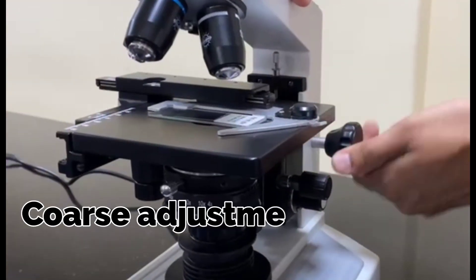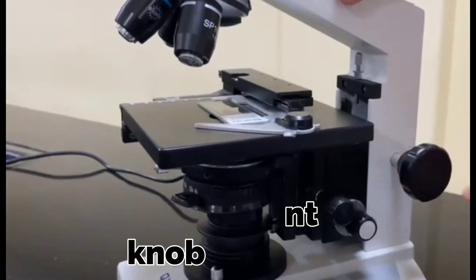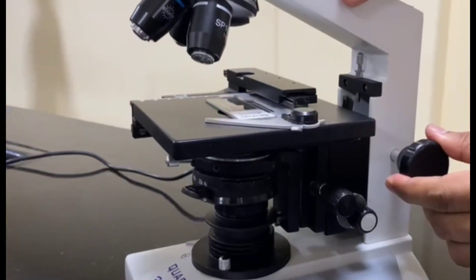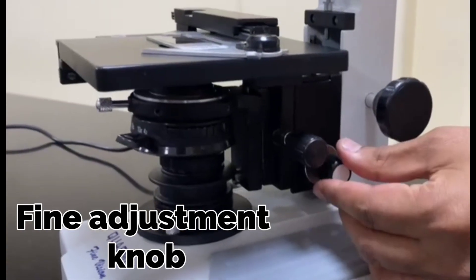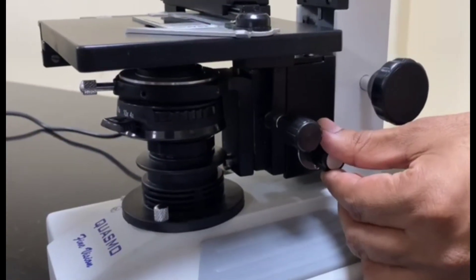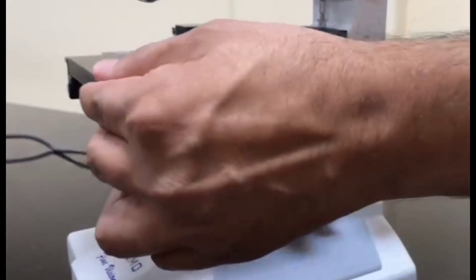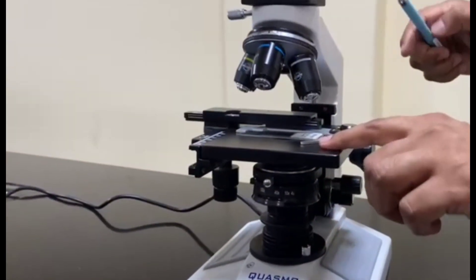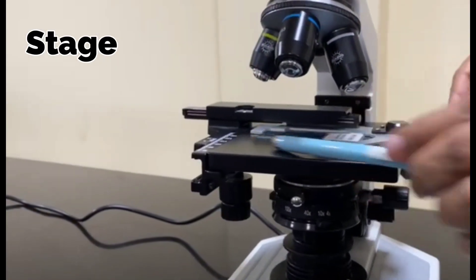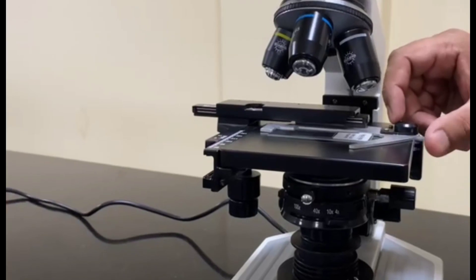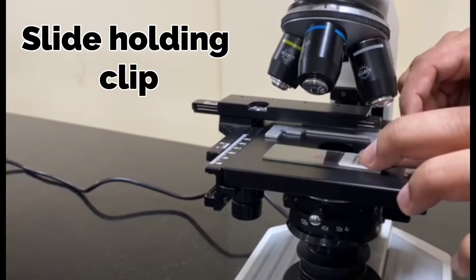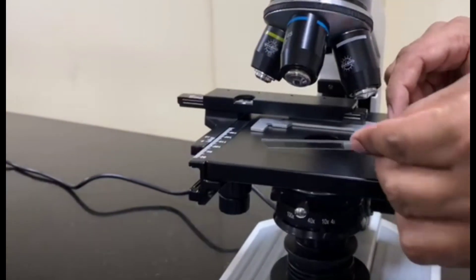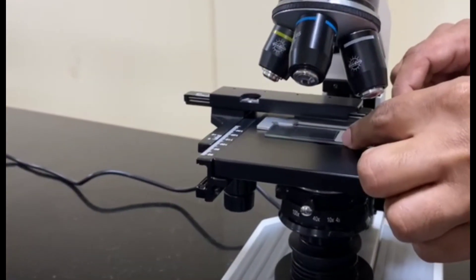This is the coarse adjustment knob which can be used to move the stage upward and downward, and this is the fine adjustment knob, which is used to move the stage very finely to adjust the magnification. Here you can see that this is the stage of the compound microscope and this is the clip to hold the slide in position. This is the slide, you can place it here and you can fix it by the clip.